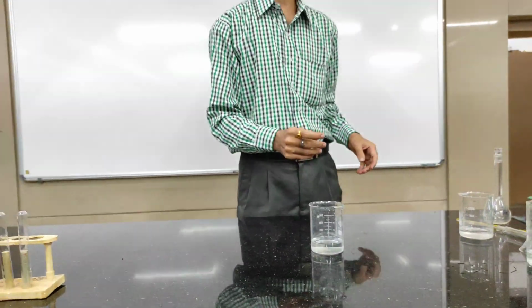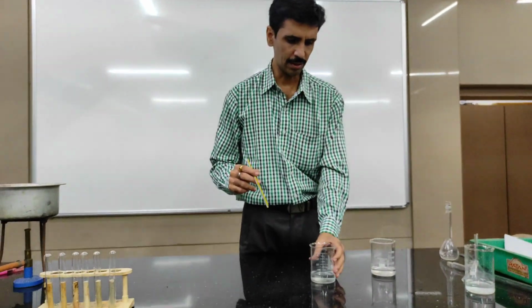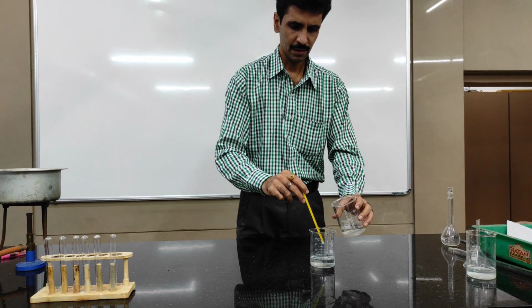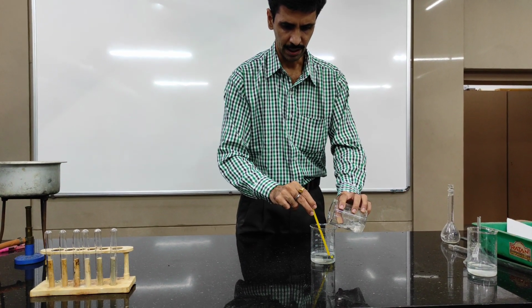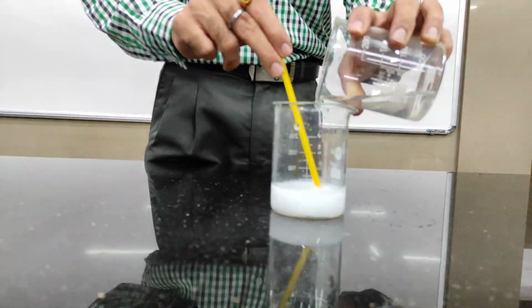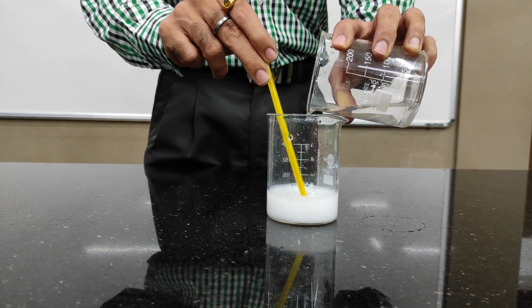Now the next step is the addition of 30 cm cube of barium chloride dropwise with constant stirring. This is barium chloride, my dear friends, 30 cm cube, 10%. So we are going to slowly do the addition, and you can see the changes which are going to take place as soon as it comes in contact. Can you see this? Yes. This is the indication of the precipitate of barium sulfate, which is white in color.